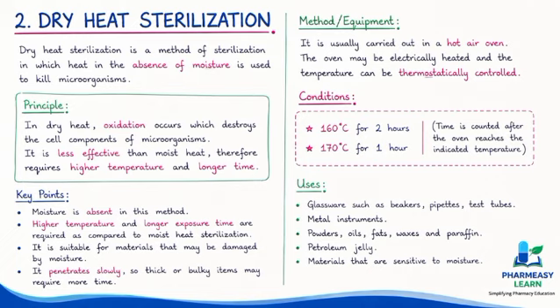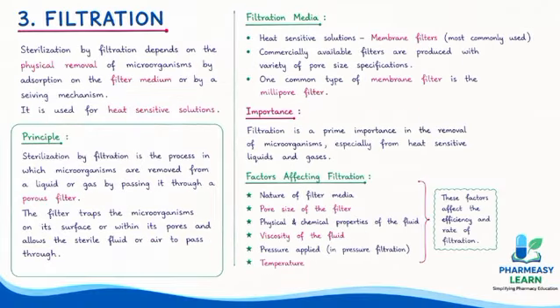Compared with moist heat, dry heat generally requires a higher temperature and longer exposure time. Proper loading of the equipment is also very important so that the heated air can circulate effectively throughout the chamber.